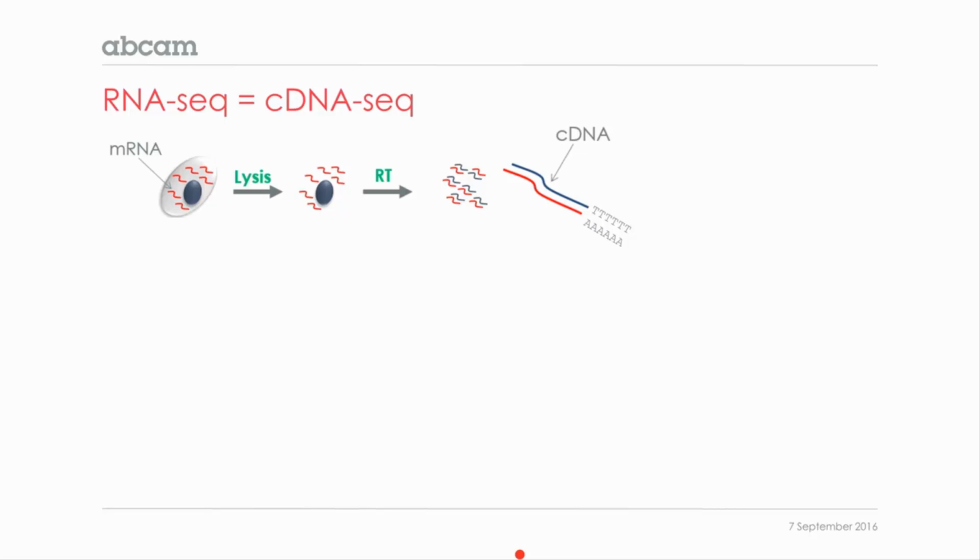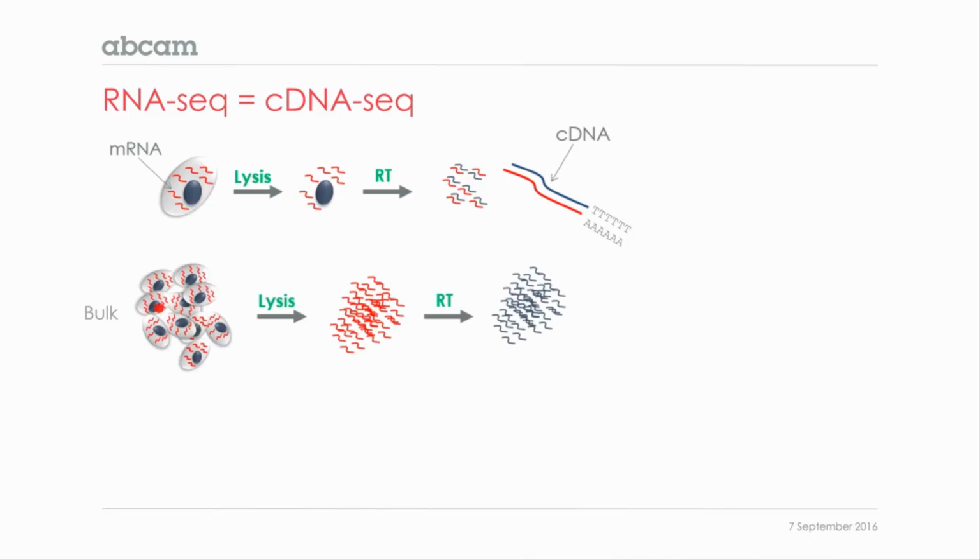Now, in bulk experiments, basically we have many cells. Sometimes people start with millions of cells. We lyse them. We get tons of RNA. We can reverse transcribe it and get a lot of cDNA. Then it's easy. We can immediately continue into standard library prep and sequencing. But in the case of single cell, of course, what we have is a single cell, and that's the whole idea. And what happens is that we end up, after the reverse transcription step, with very little material.